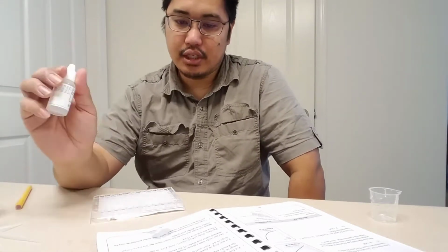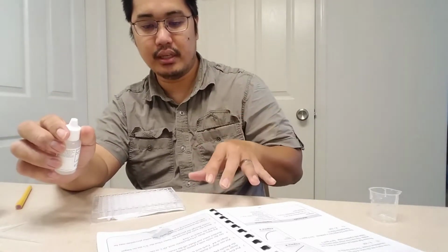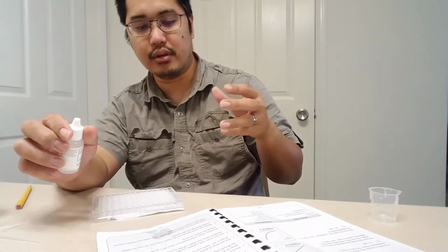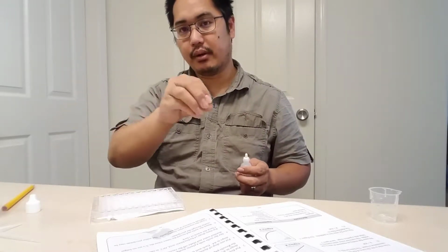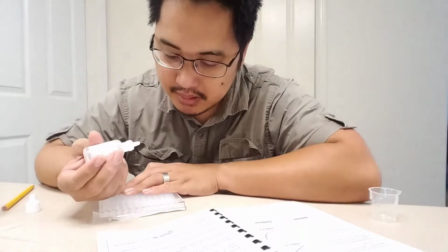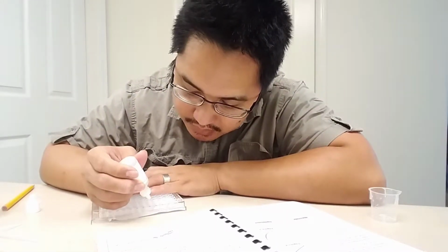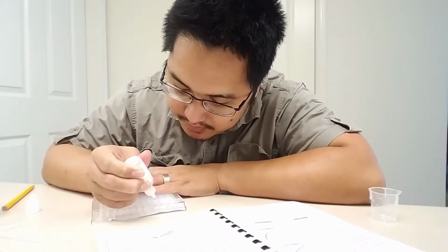Now I'm going to put 3 drops of hydrochloric acid in each of the wells and start the clock. I'm going to see exactly how long it takes for these precipitates to not be visible. I think what I'm going to do is try to do it as quickly as possible. I'll start off with A5 and I'll work my way down: A4, A3, A2, A1.